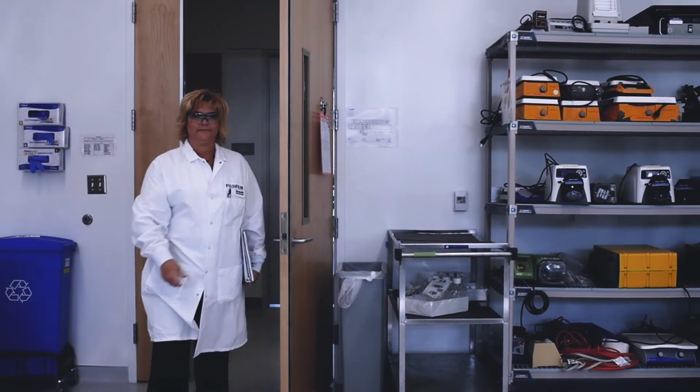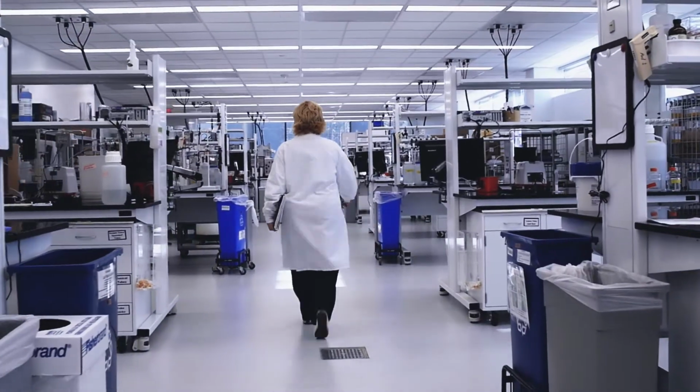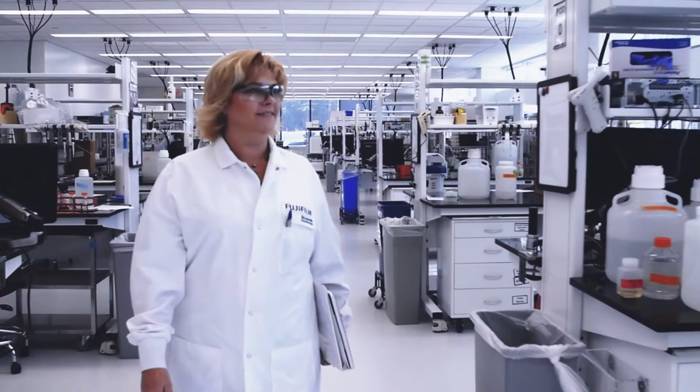Stainless steel reactors are still the most preferred option for large scale, such as 5,000 to 10,000 liters, but single-use bioreactors are quickly becoming the preferred option for small-scale reactors, such as 1,000, 2,000 liter. The choice of the bioreactor is also important with regard to the future. Will the bioreactor be able to meet the demands of future processes, higher cell densities, higher production quantities, and increased regulatory requirements?